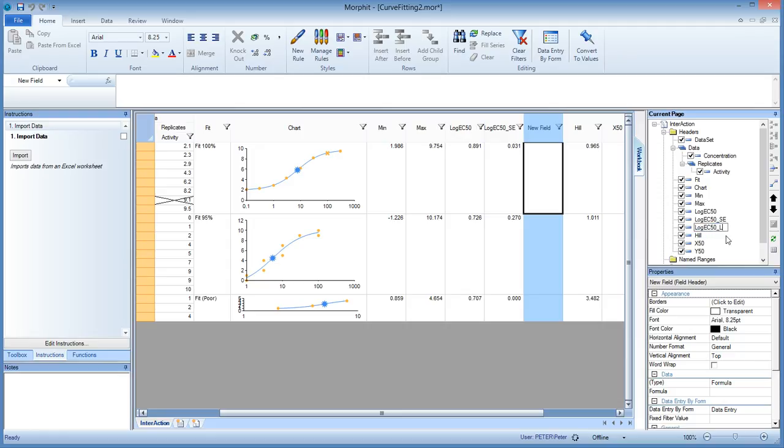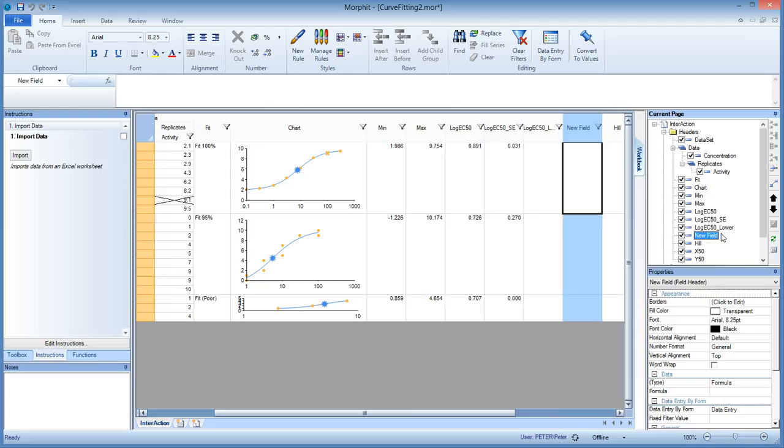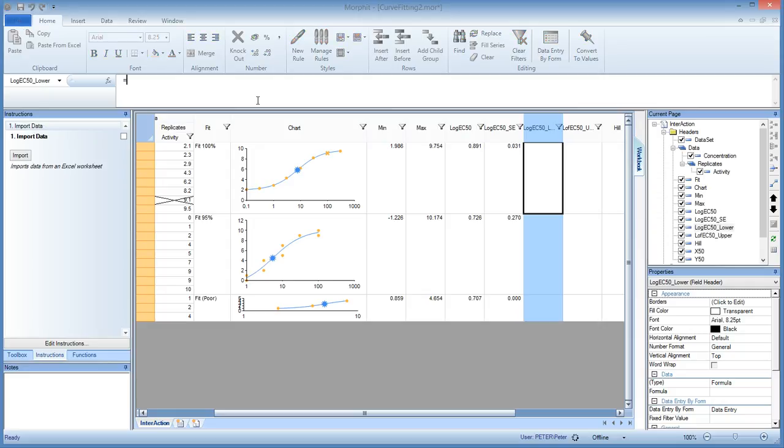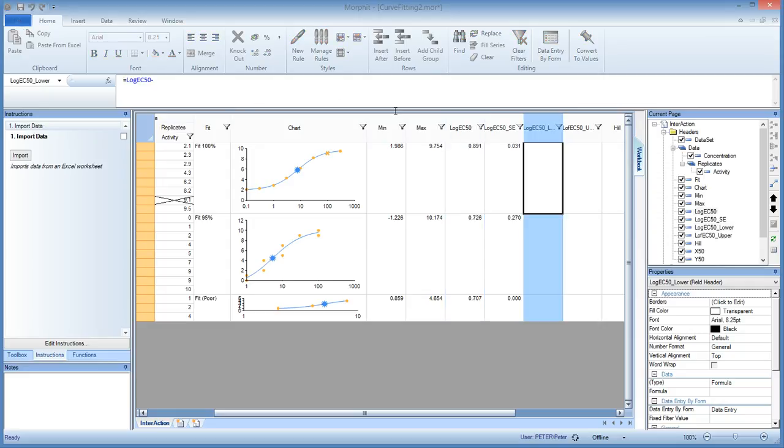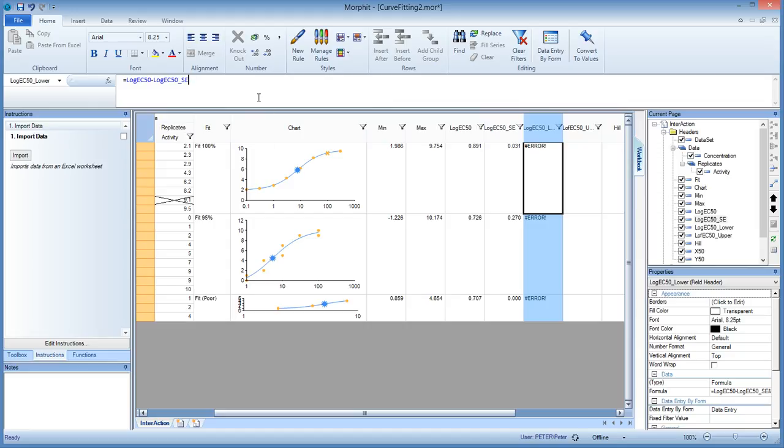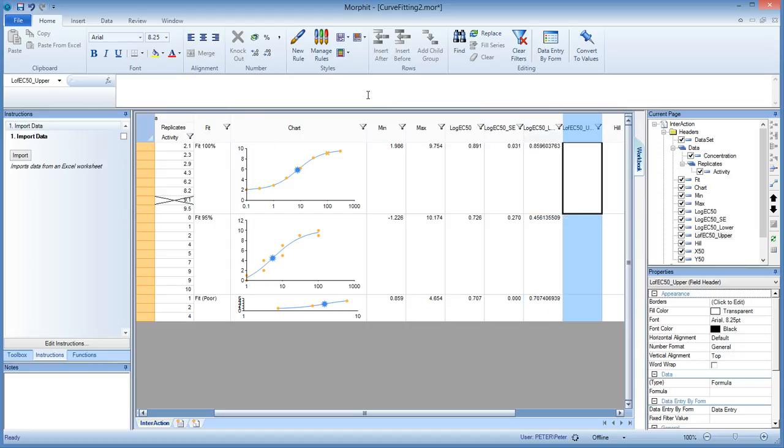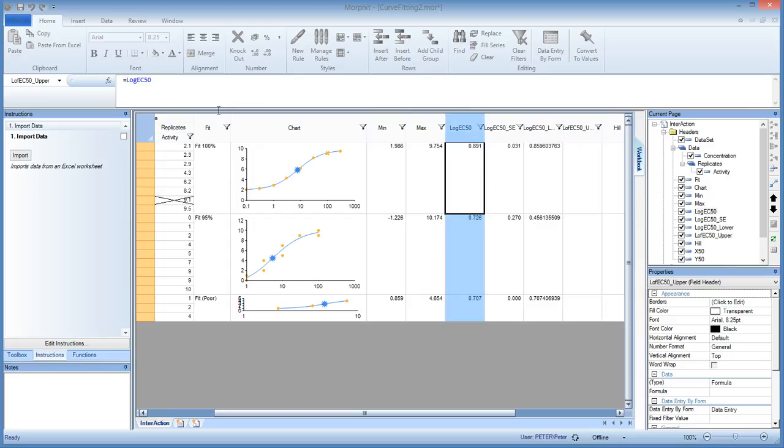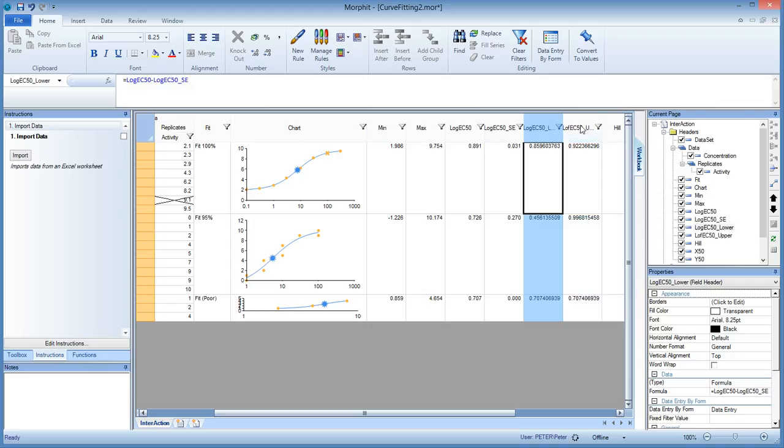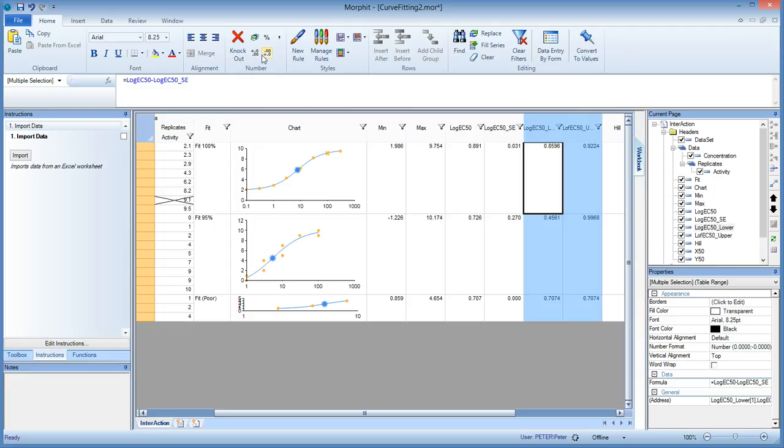So let's reduce the number of decimals. And then we can use this SE to work out the log EC50 lower. That is the lower threshold of a range we want to compute. And this is the log EC50 upper. The higher threshold. So the lower is computed just by taking the log EC50 itself minus the SE. Oh, there's an error in it, sorry. There we are. And then the upper is computed as the log EC50 plus the standard error. That's it. So reduce the number of decimals. This is it.